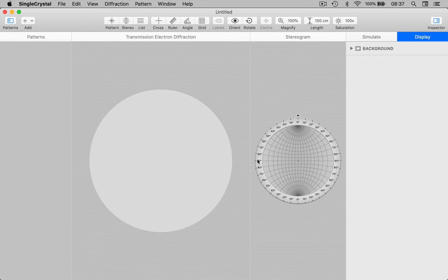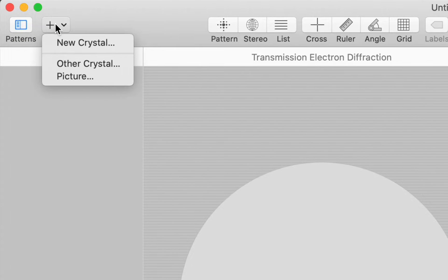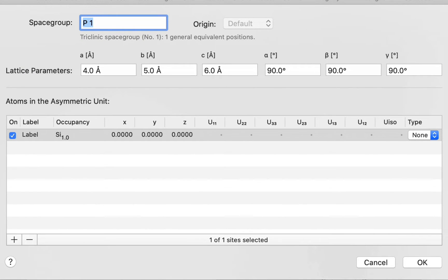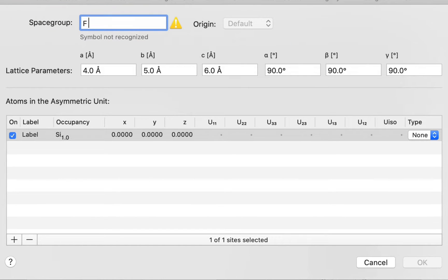Let's start with an empty window and we'll add a new crystal using the crystal editor. I'm going to go to the Add pop-up menu and choose New Crystal, and you'll see that we get an editing sheet. We're going to start by entering the space group symbol using standard syntax with spaces between the different symmetry operators. I'm going to enter a cubic space group: F D bar 3 M.